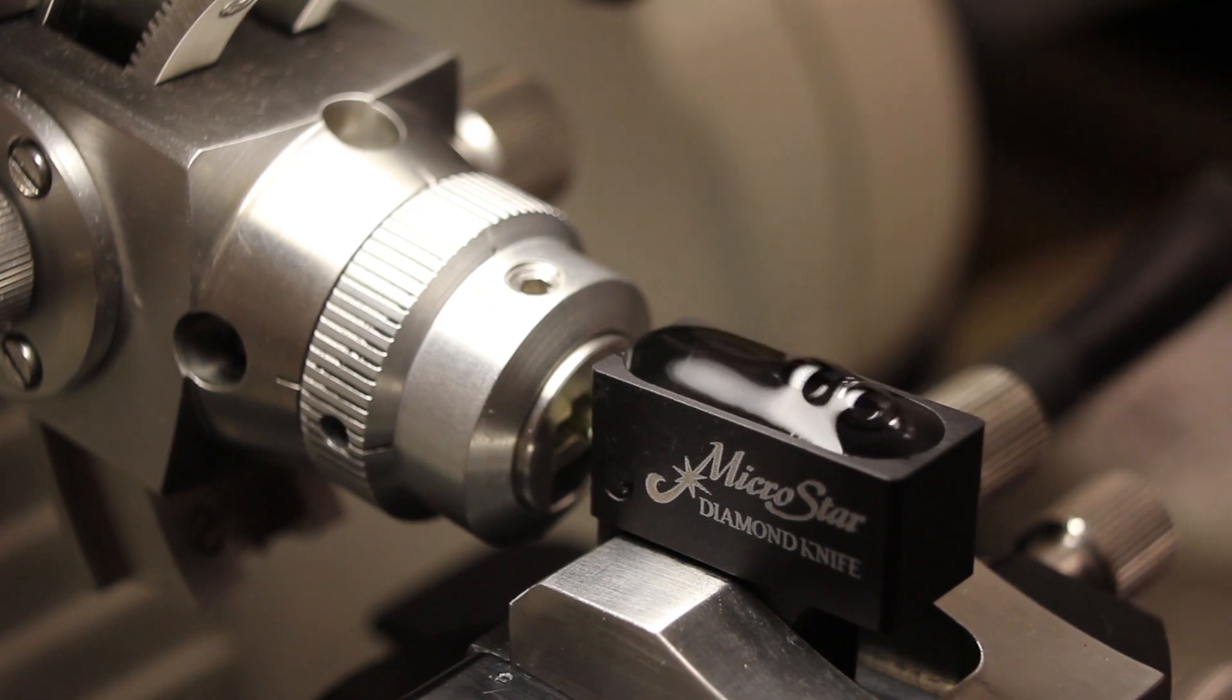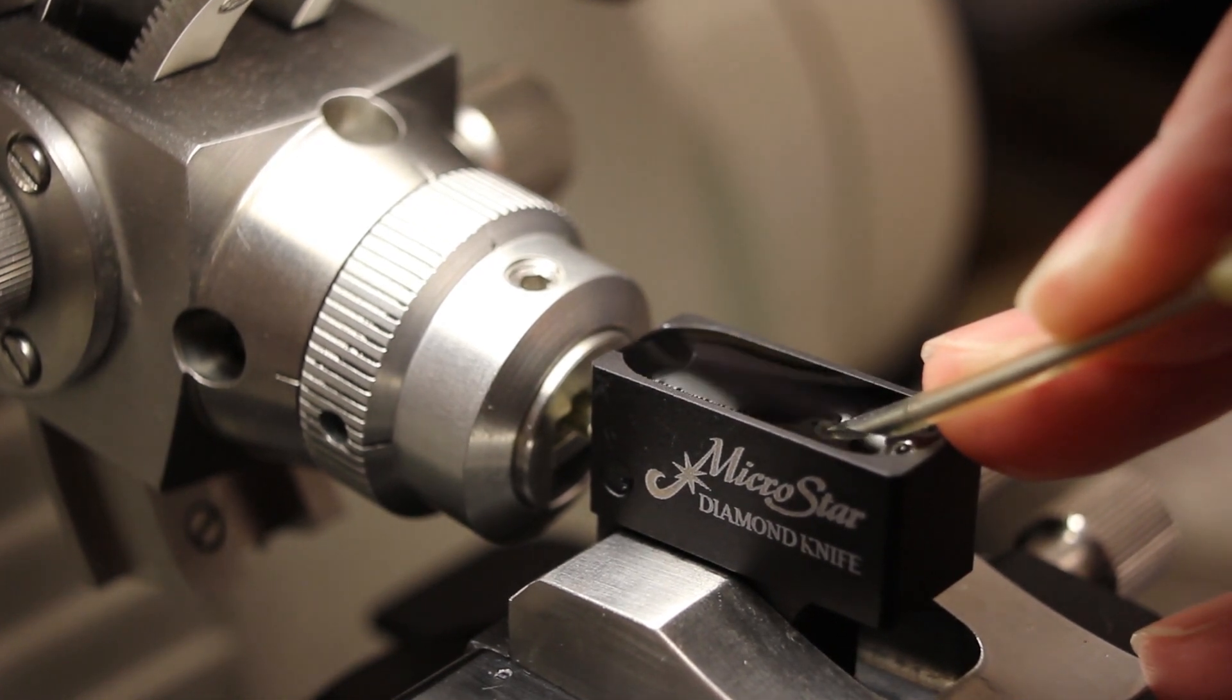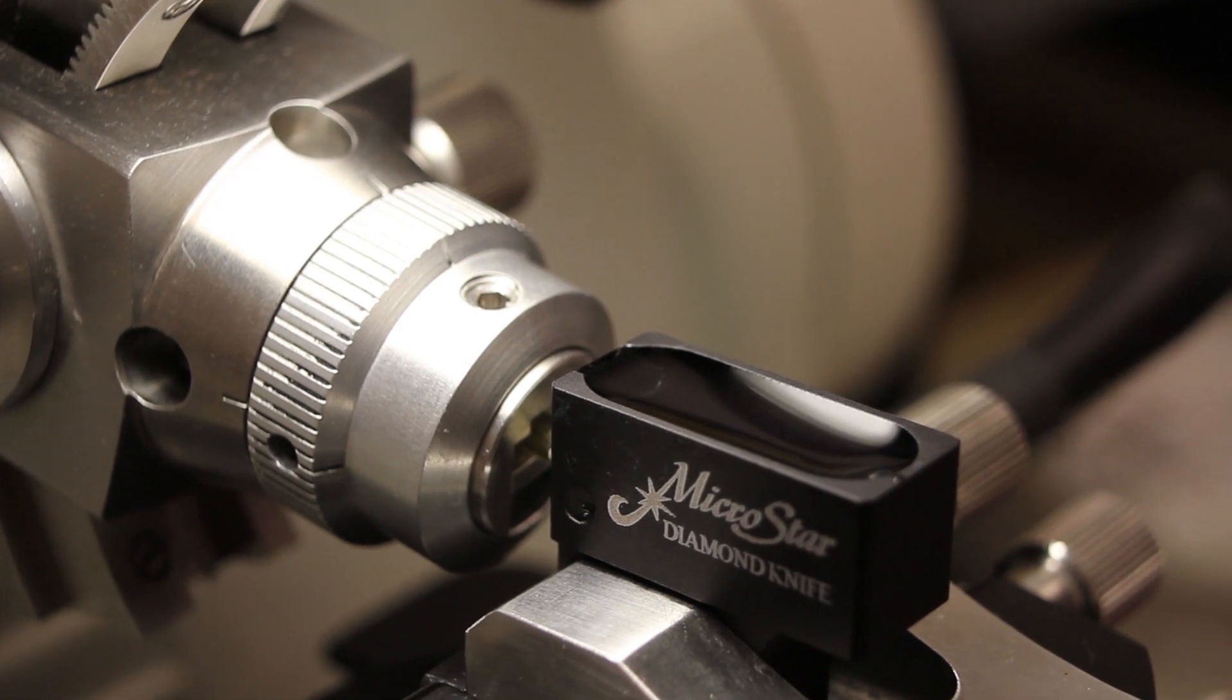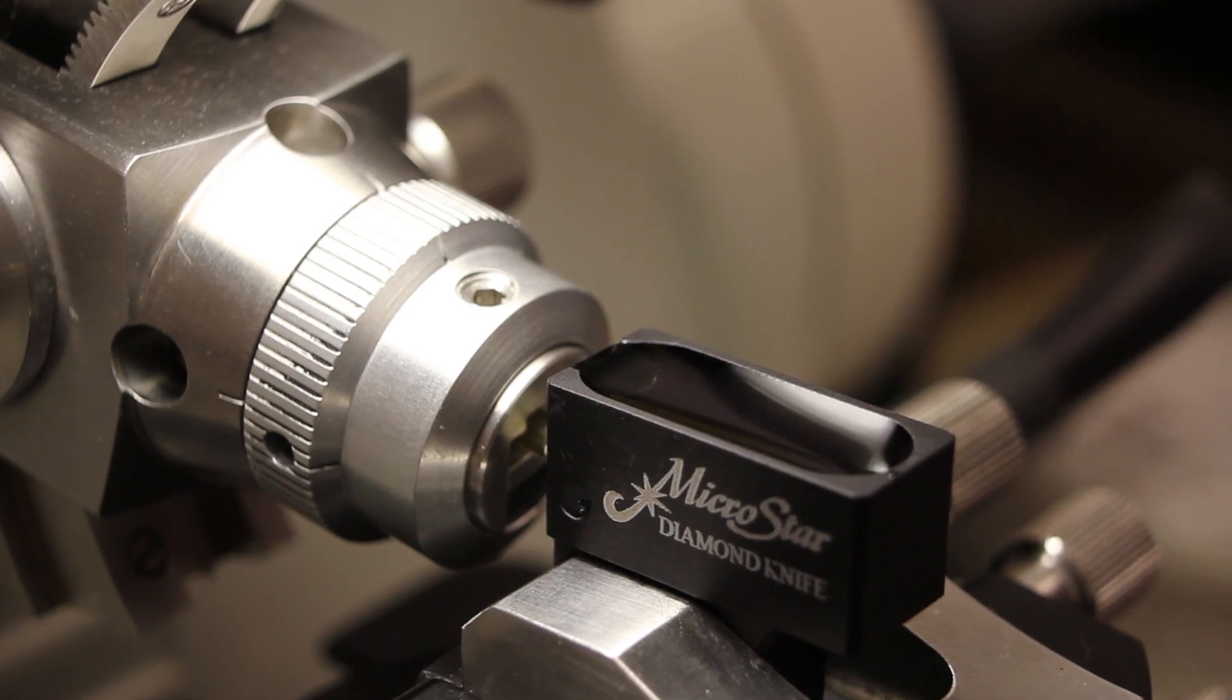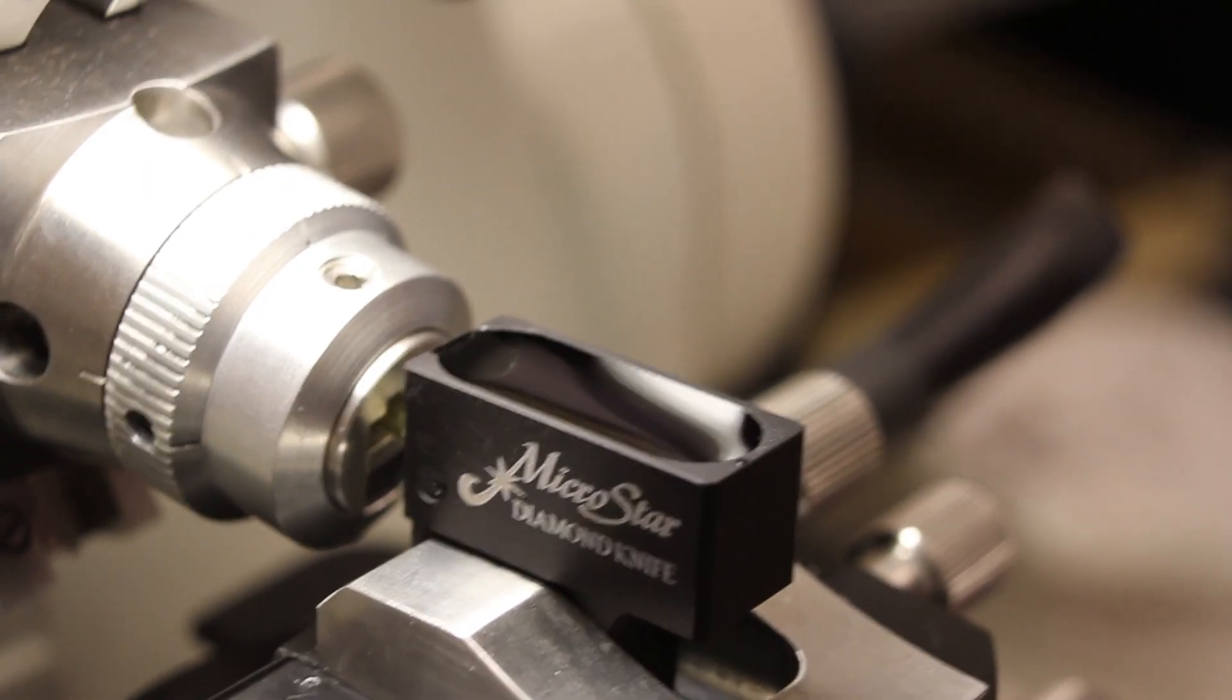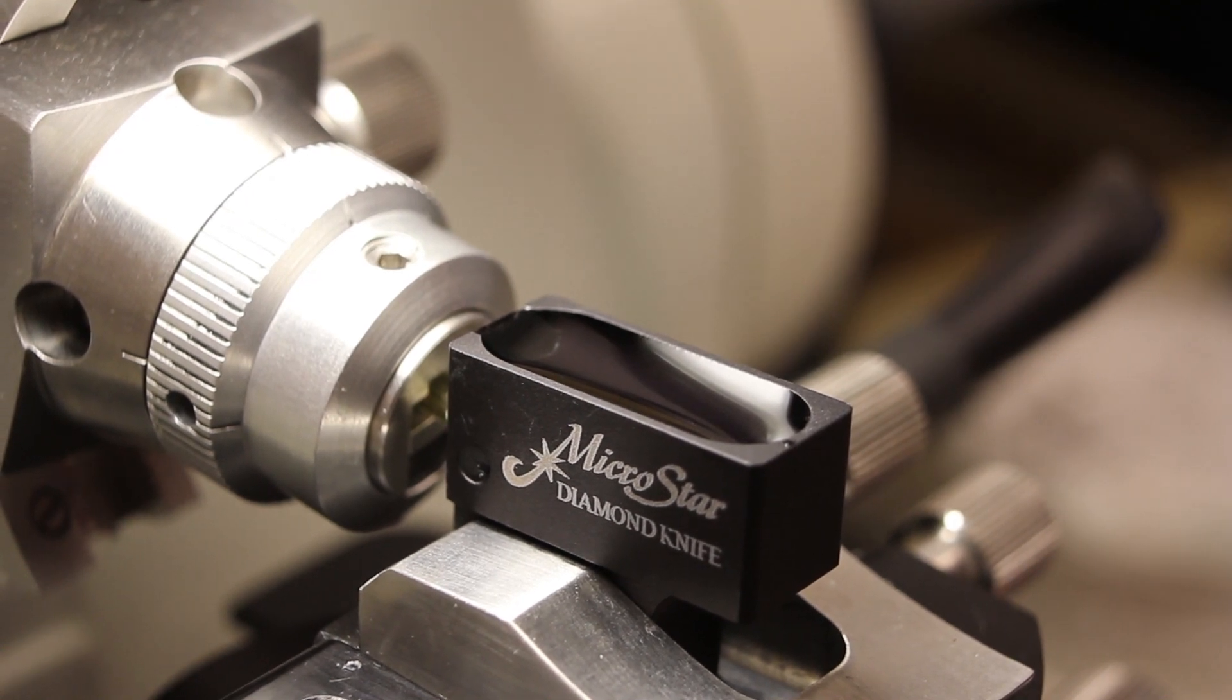Did you just slice it? No, I'm not close enough to slice yet. What you got to do is get this back. You want to look through the eyepiece. You'll see there's kind of a flat gray meniscus at the edge of the knife. As the sections come off, they come off that knife edge, you can tell how thick they are by what color they are. And you want them to be very pale gold, sort of between gold and silver when they come off. And then you're going to take your grid in a pair of fine forceps and reach down, go underneath your sections that are floating on top of the water, and then come up underneath them.